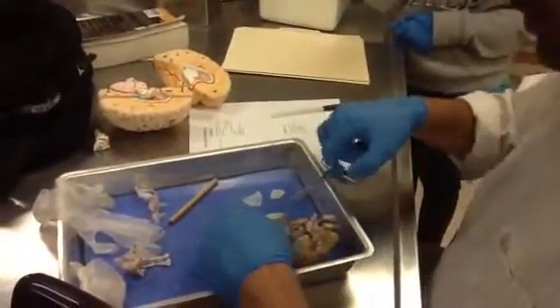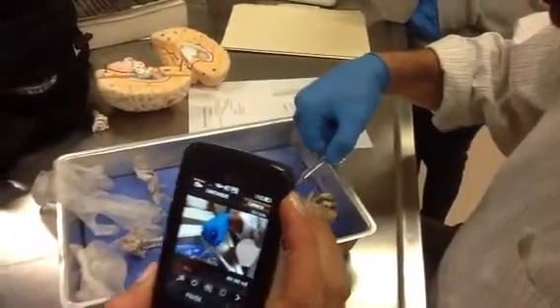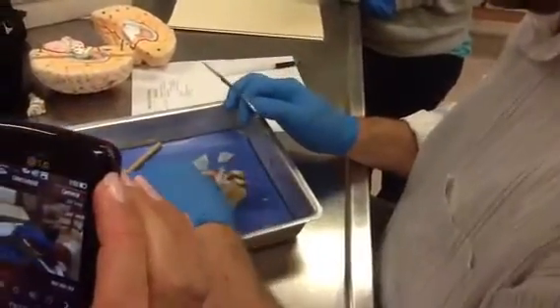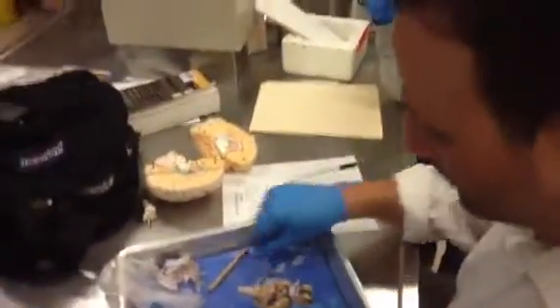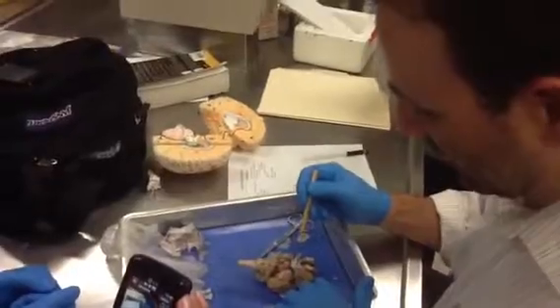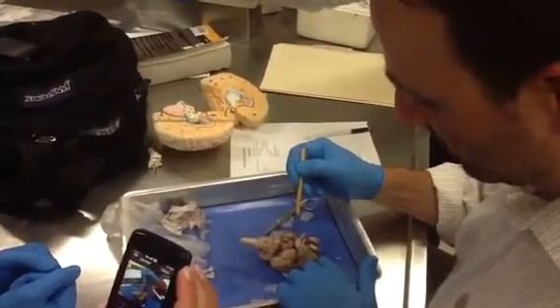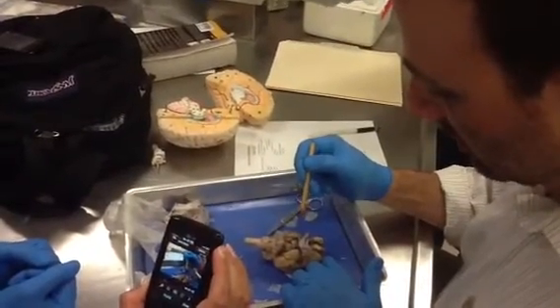Okay, so now there's more cranial nerves. You can see them. No more eye movement for this guy. Okay, so we can kind of make out there's still dura in there, but the optic chiasm, you can see as we come down. This is like the hypothalamus. So the pituitary attached right here. This little stalk that I pulled off, right in that little spot. That's the mammillary body right there. So this little area, that's the hypothalamus.